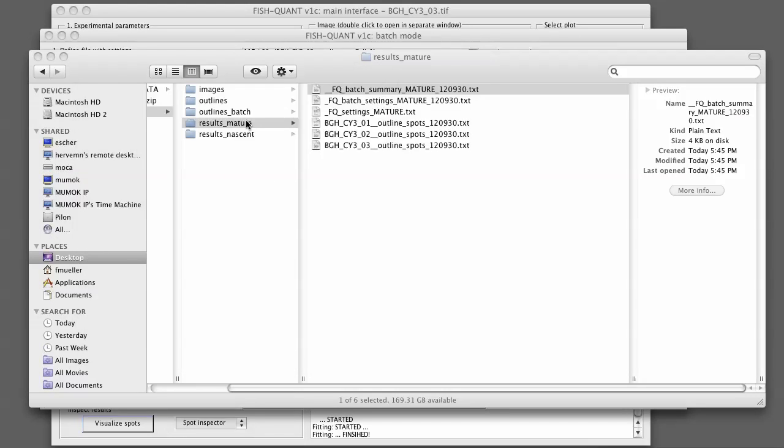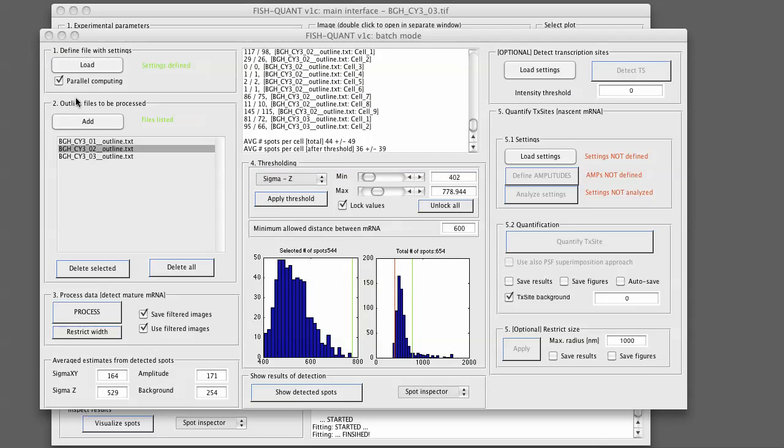For more details about how those files look like, I invite you to look at the help file. And in the next tutorials, we will then show you how to set up the nascent mRNA quantification.